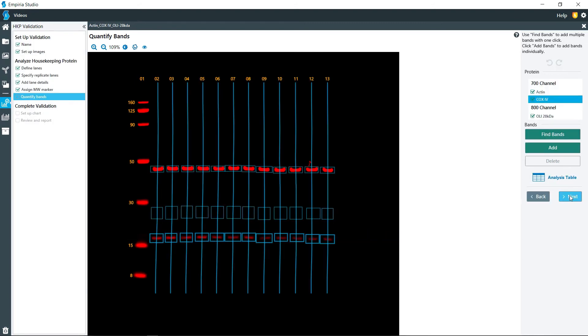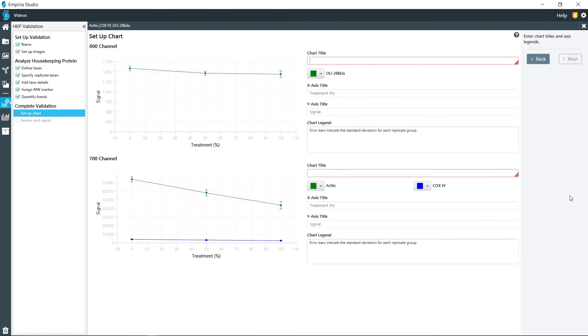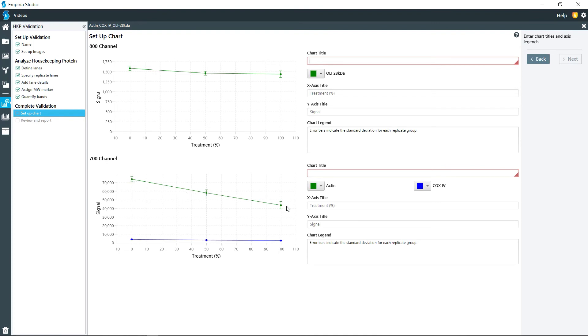And so once you've completed all that, go ahead and click on next and it will create some charts on here. This one is for the Odyssey loading indicator, this one is for the COX-4 and actin. So you can see right here that maybe actin was not the appropriate housekeeping protein for this particular treatment.